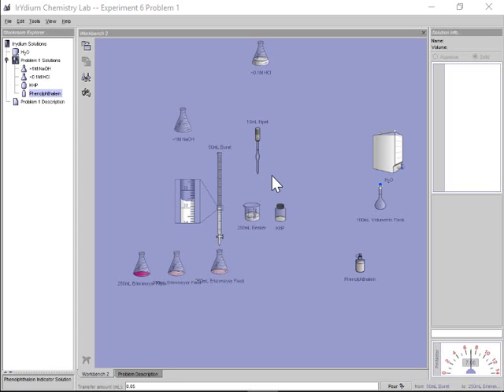At this point here, I'm ready to do my second titration. So far, we've taken our primary standard and I made a standardized solution. I know this concentration. This was the 0.900 molar solution. I knew that concentration really, really well, and I used that to titrate the NaOH. The NaOH at first was already told to me. It was about 1 molar NaOH. What we found through our titration was it was only 0.92.